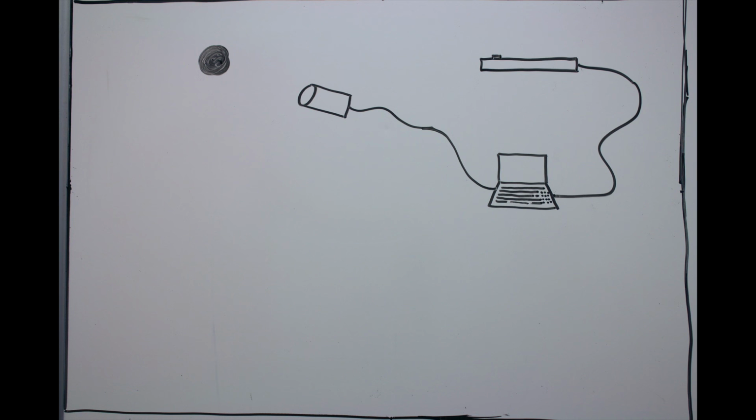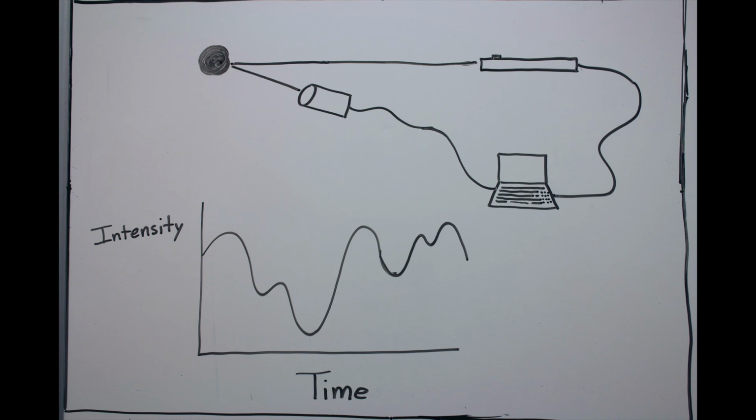For particulate samples, particle size is one of the most important physical properties. The size of a particle has direct influence on properties like reactivity, stability in suspension, texture, flowability, viscosity, packing density, porosity, and dissolution rate.